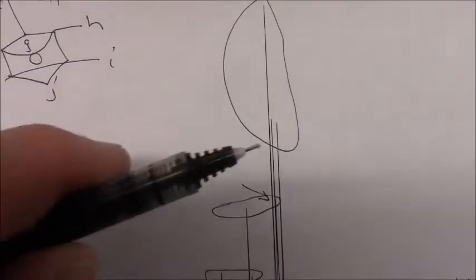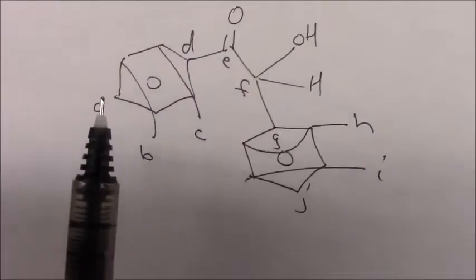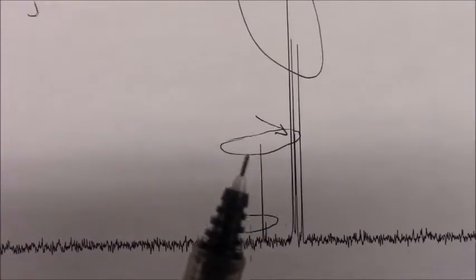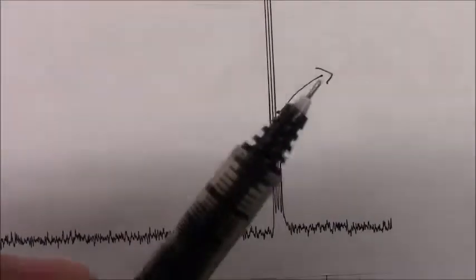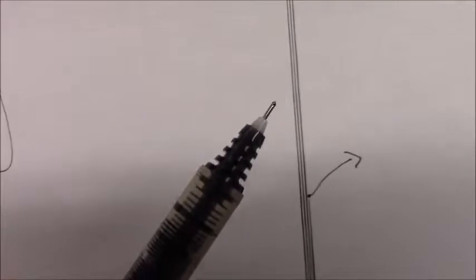The mid-height ones, if you see a difference in height, the taller ones are either duplicated or overlapping. So for positions A and J, there's only one of each. It turns out that you see 2 peaks at this mid-range height, A and J, and then this is the rest, which would be B, C, H, I. F, of course, is furthest to the left, and it's built right in just to the right of the solvent triplet peak. Whoever made this one, it wasn't very concentrated, so that is the carbon F.